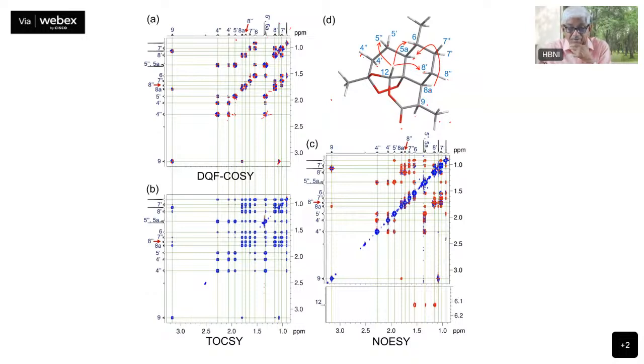And I think it looks like it is around 0 ppm. No, this will be around 0.8. It is around 0.8, so around 0.9. So one of those methyls, no? The methyl which is connected to carbon 6. I guess so. So I think this methyl is connected to the proton 6 here.